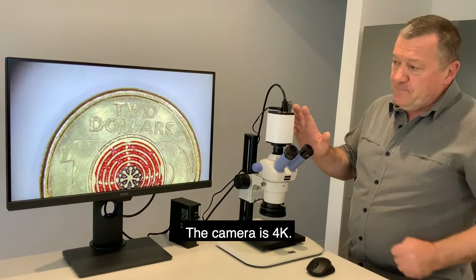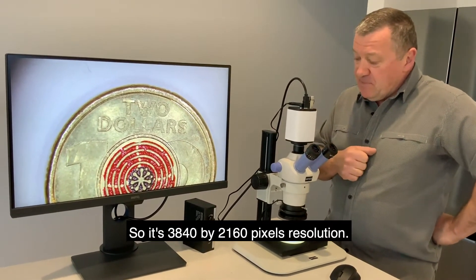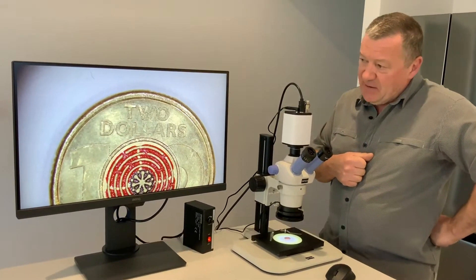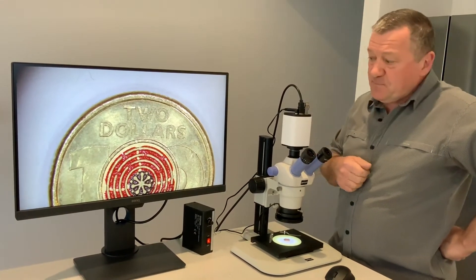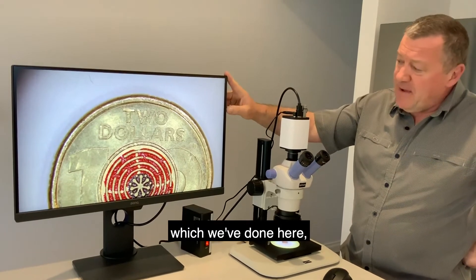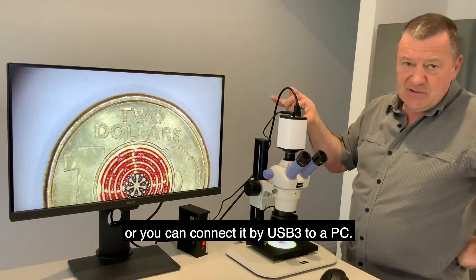The camera is at 4K, so it's 3840 by 2160 pixels resolution, and that's actually 8 megapixels. You can connect it direct to the HD monitor, which we've done here, or you can connect it by USB 3 to a PC.